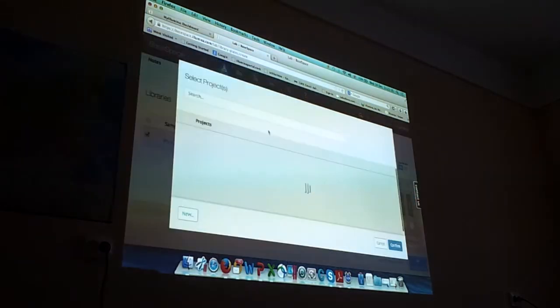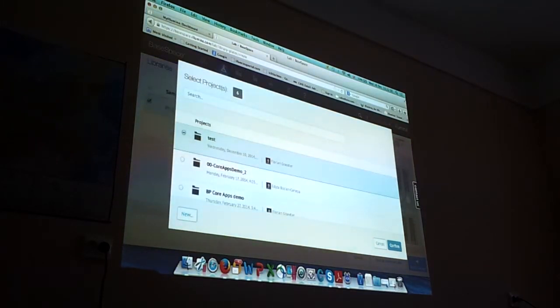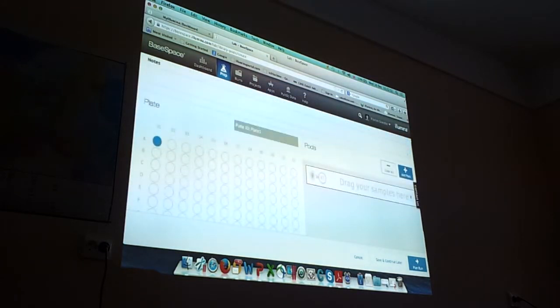This is the project here. There needs to be a name for that.